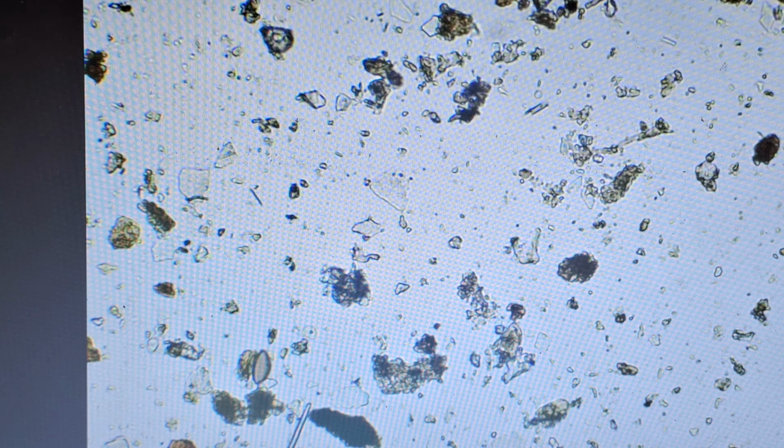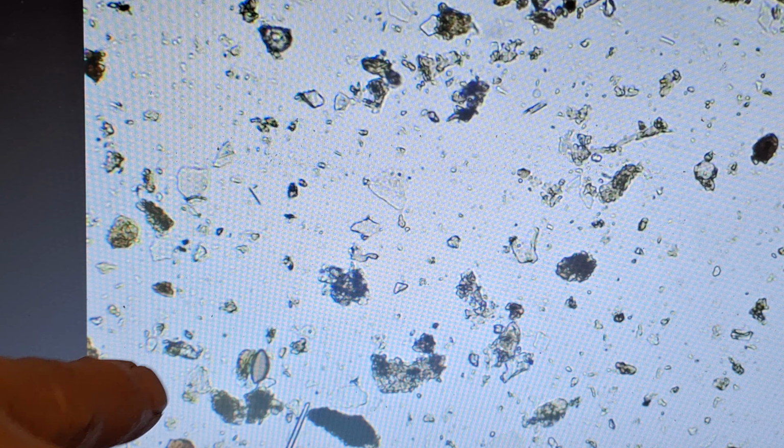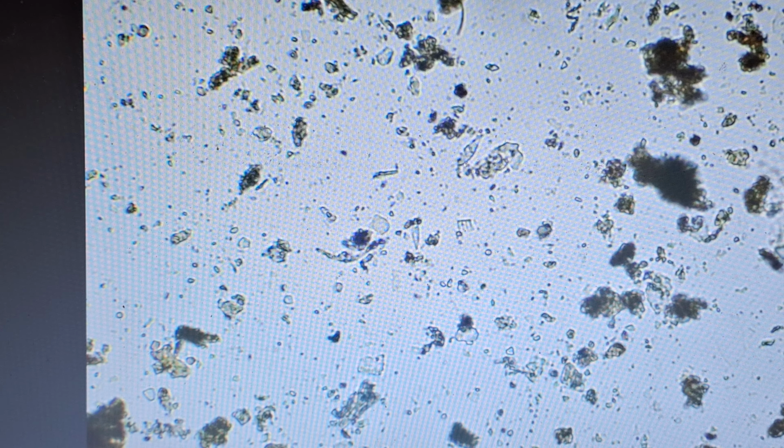We'll back off to 100x. Just do a little look around. Nice fungal spore, that oval shaped one there. Just real nice aggregation. Nice breakup of the soil particles. We're going to see more yellowish ones.